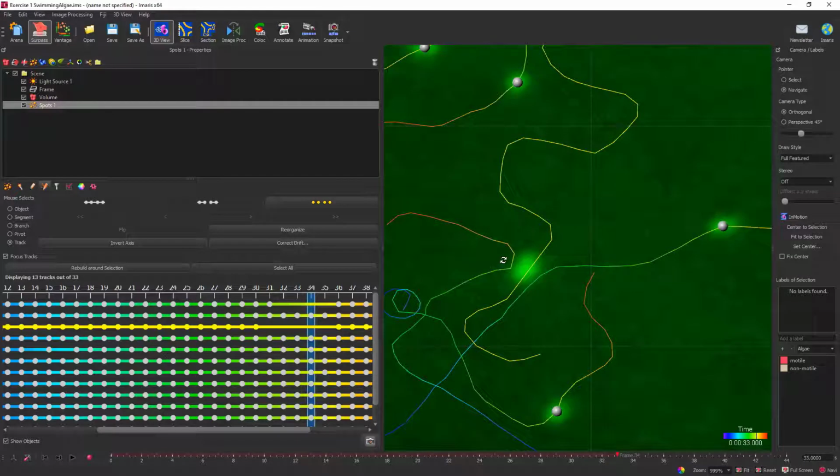So now we see that these two tracks are complete. I still get accurate total displacement. I still get a pretty good mean velocity. So it really depends on what statistics you're looking for. If you're not necessarily looking to have a data value at every single time point, but you're looking for more overall statistics like motility or overall displacement, overall speed, overall velocity, then this is definitely an option for you.